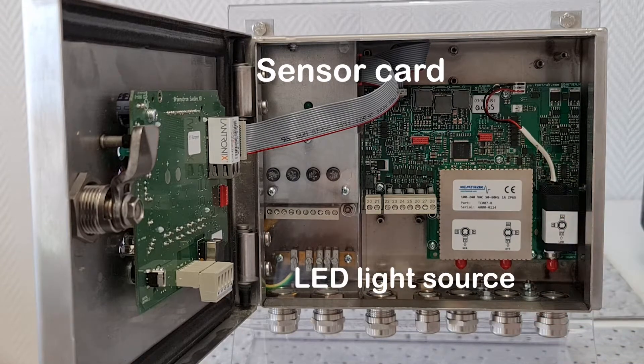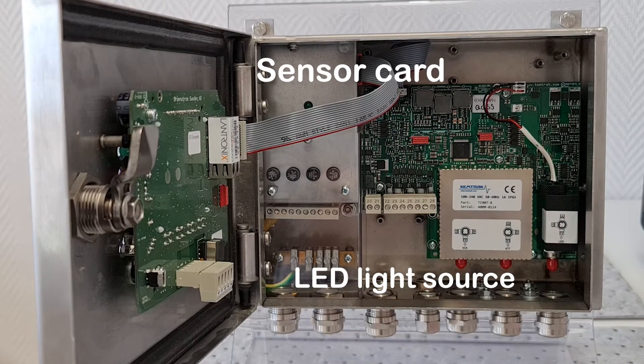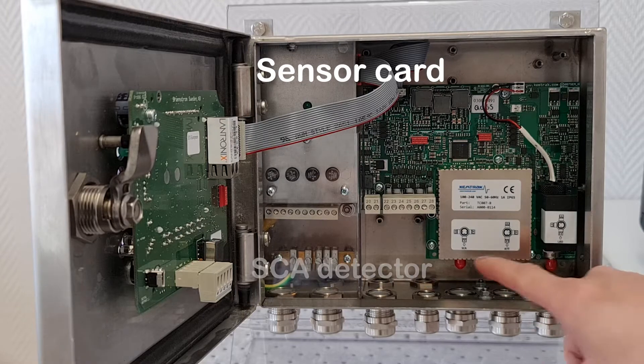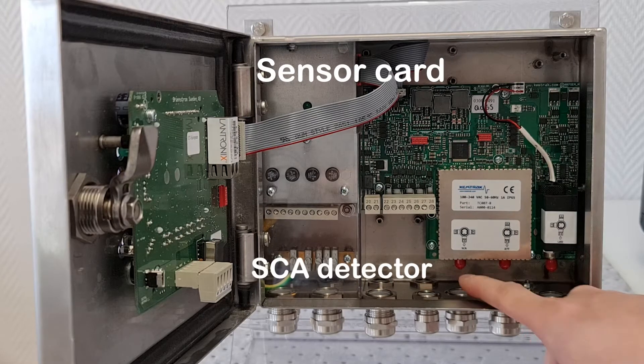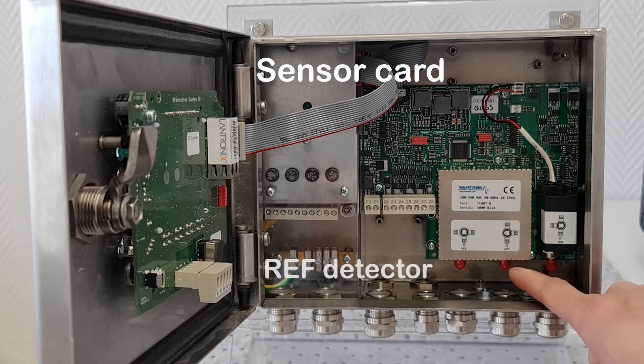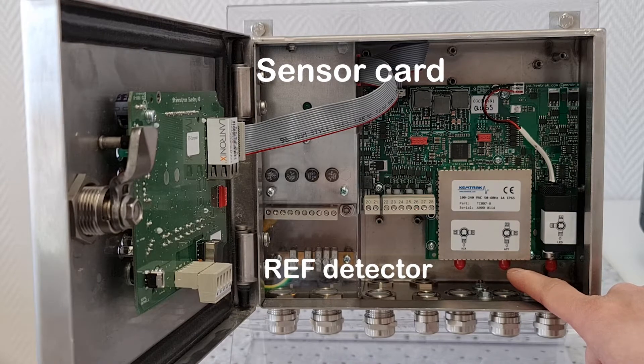The high performance LED light source is located to the right. There is one photodiode detector monitoring scattered light and a second reference detector that monitors attenuated light.